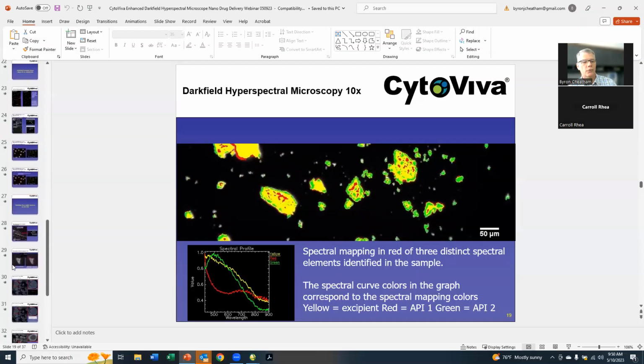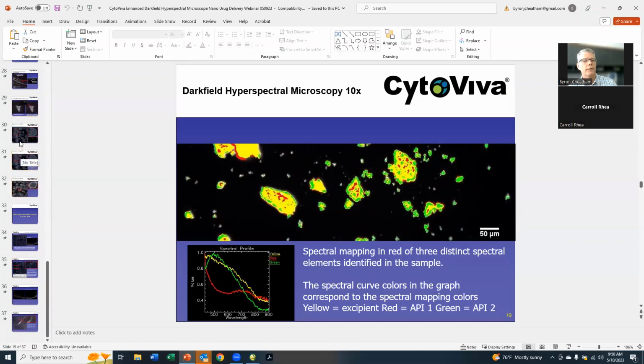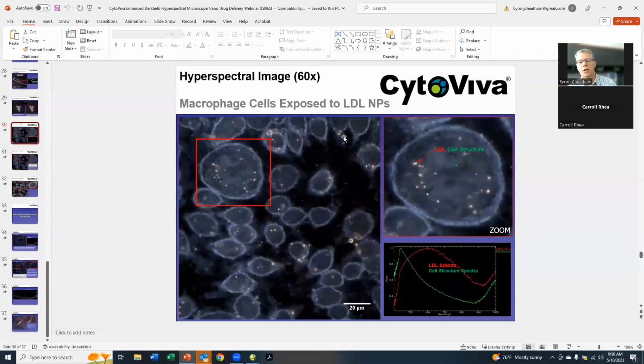Let's go back to this large image of a large number of macrophages. This image capture may have taken a few minutes, and I've got, again, hundreds of thousands of pixels in this image, and all of those can be analyzed really quickly. It's going to take a little longer, in terms of seconds, to analyze this image versus the smaller image, but you can decide how big you want this image to be based on the image capture.